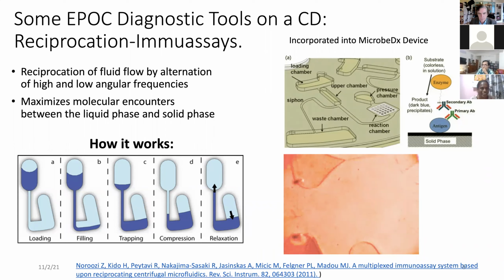Slow down. Yes, there we go. Slow down, right? Because then the centripetal force is lesser. And the expansion here is just the gas law; the air can expand against the centripetal force and push the liquid back up. Good. So that was the second question. So we got that one.